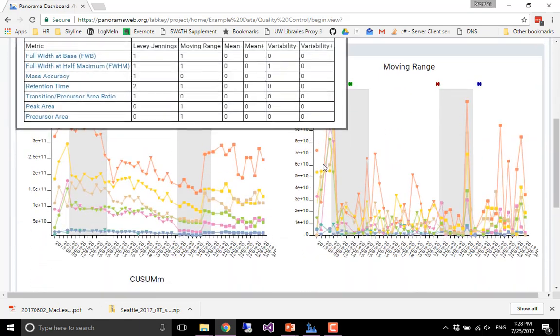There we go. Where we basically identify different types of trends. So if we have increased variability, for example, even though we might be bouncing around in the same overall range for a given metric, we can see on these other plot types that it comes out. Or if we have a slow trend, slowly going up or down but still within our normal window overall, that can be highlighted in some of these other plots and flagged as an outlier.